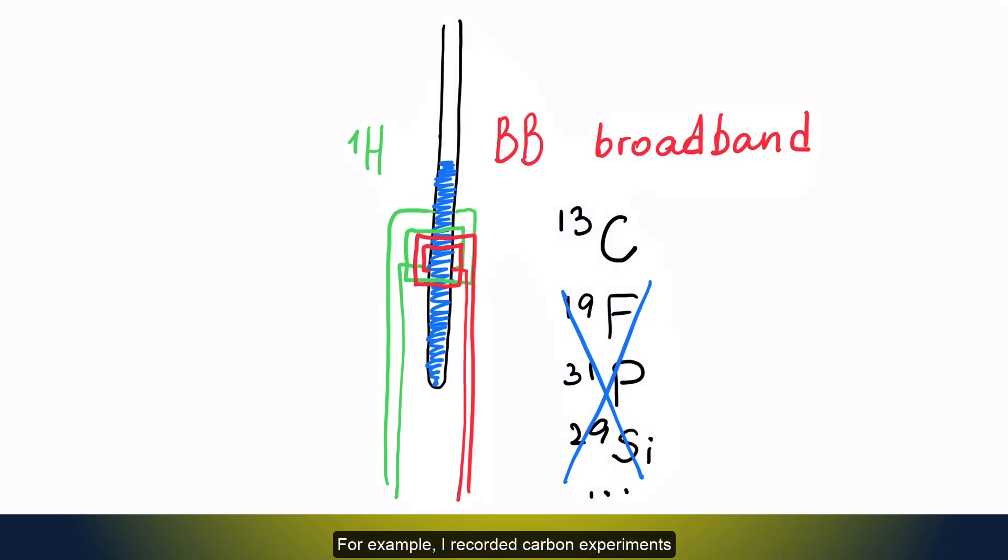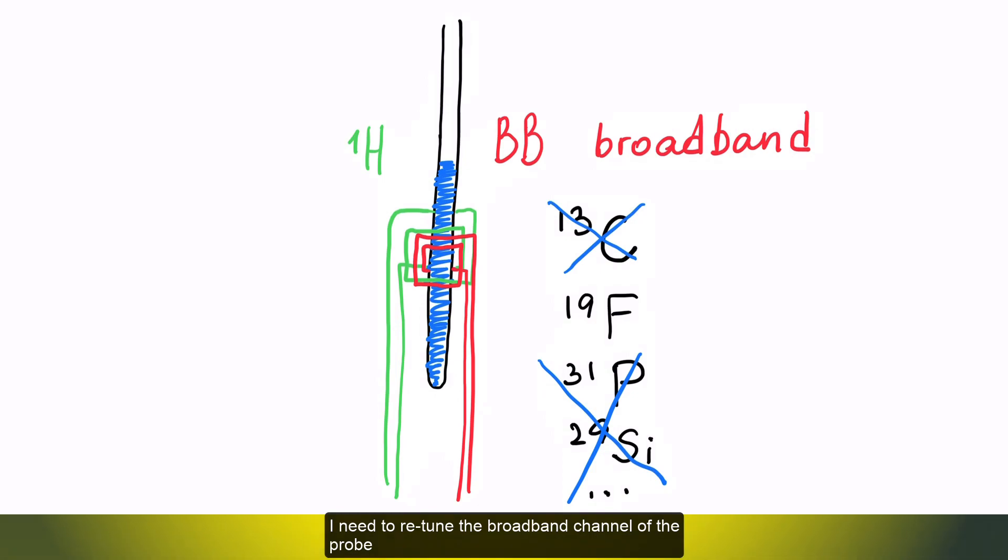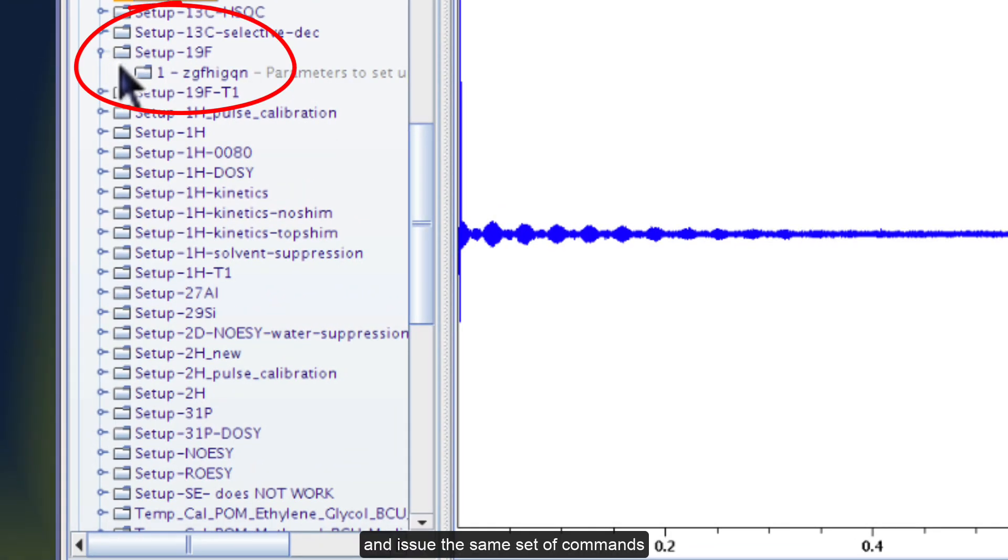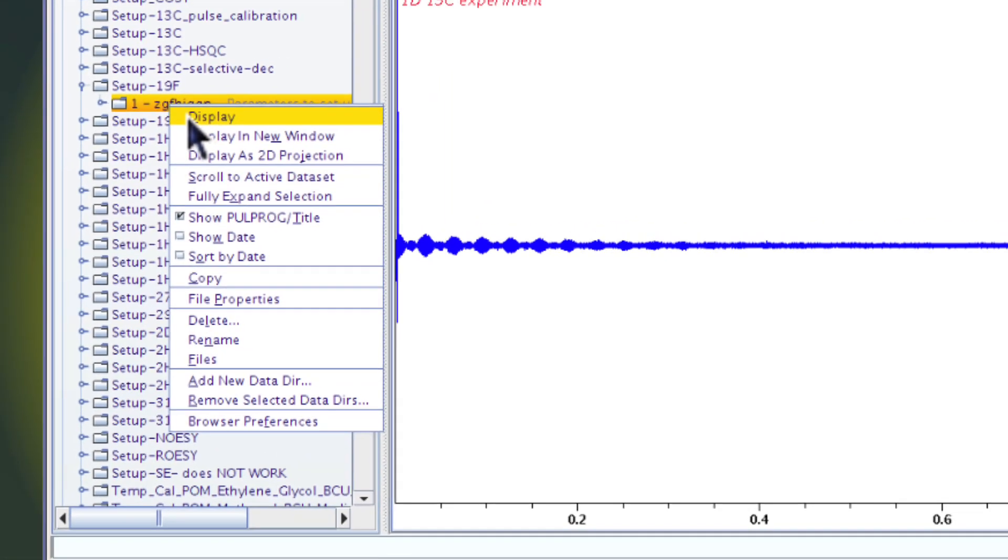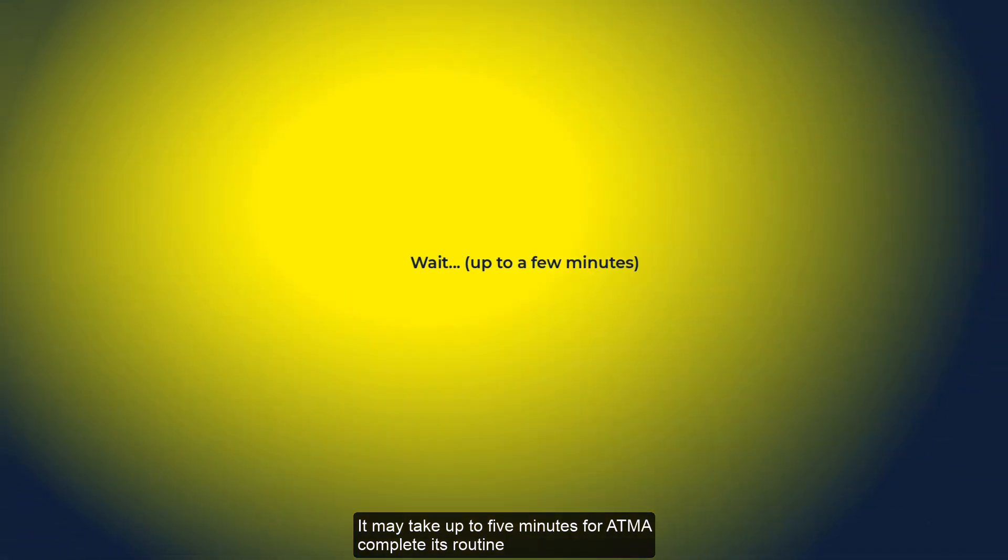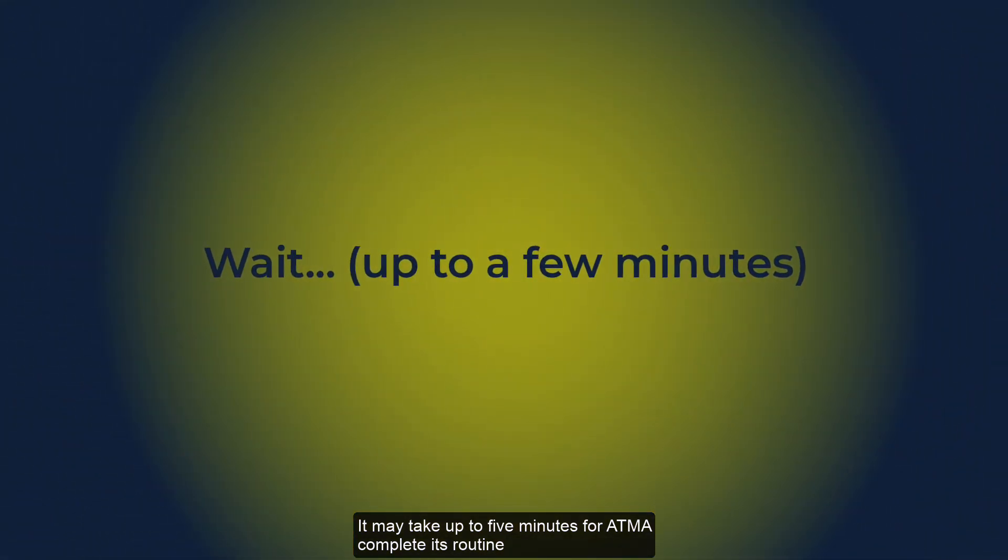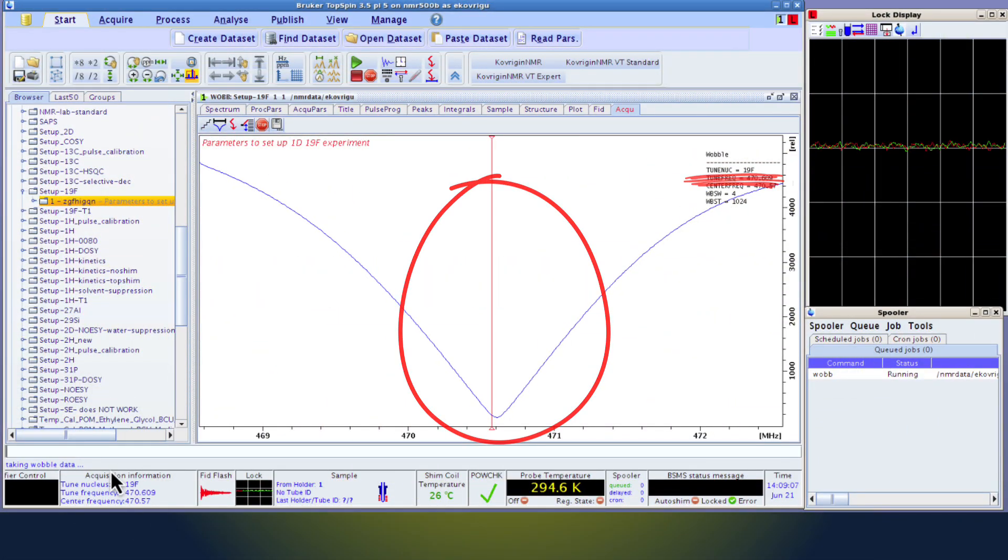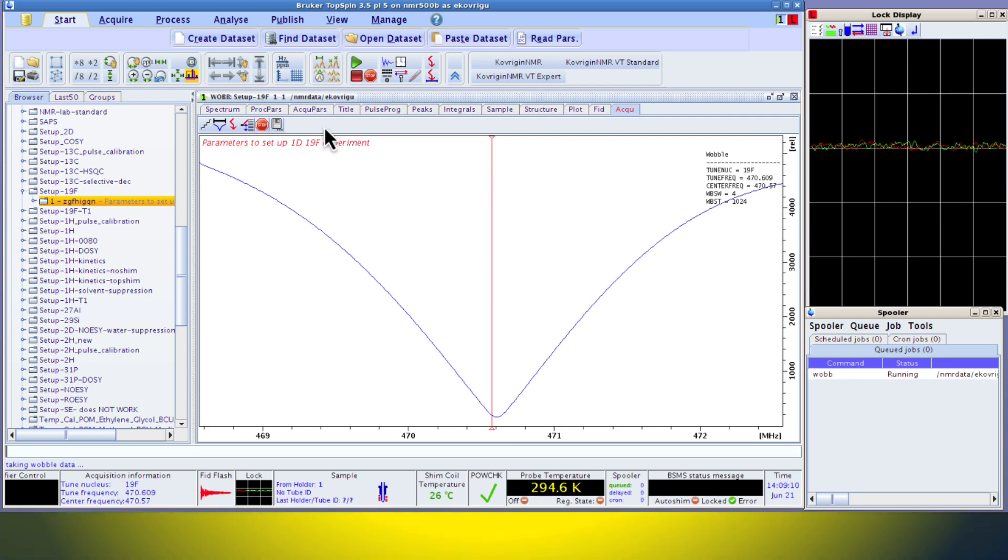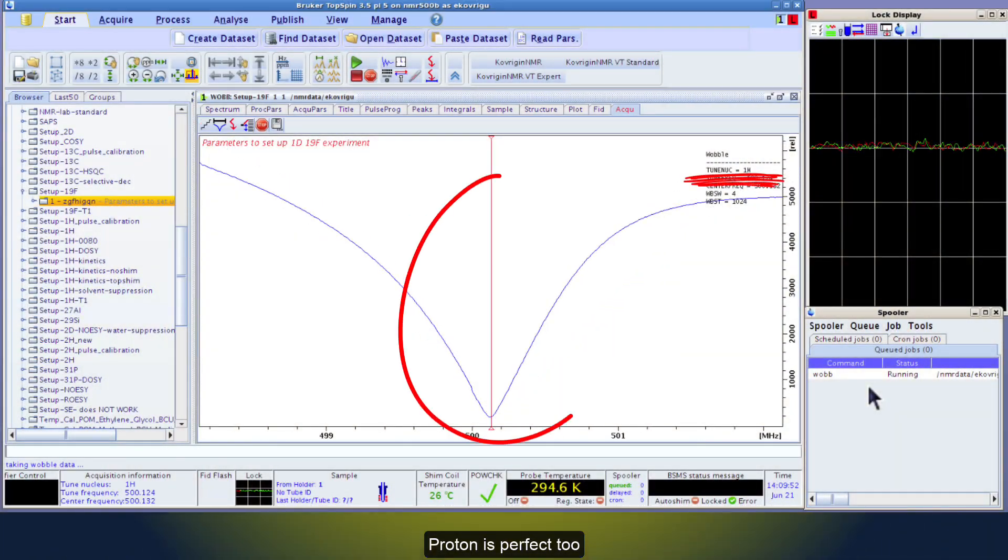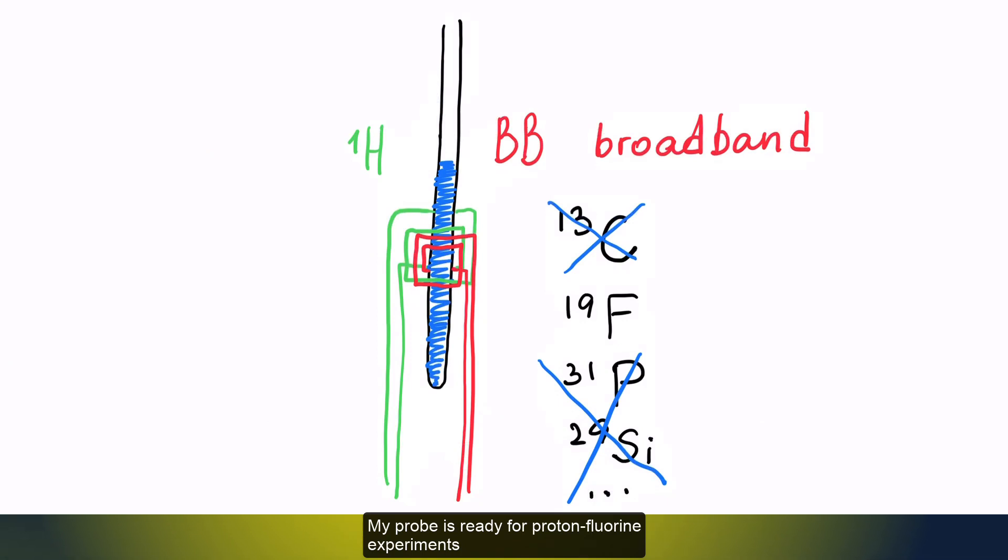For example, I recorded Carbon experiments and now want to record Fluorine. I need to retune the broadband channel of the probe. To do this, I will display the Fluorine experiment and issue the same set of commands – QU-RO-OFF, QU-ATMA, QU-WARB. I will be patient again. It may take up to five minutes for ATMA to complete its routine and for the WARB to display the final results. Fluorine is good. I will check the Proton. Proton is perfect too. My probe is ready for Proton-Fluorine experiments.